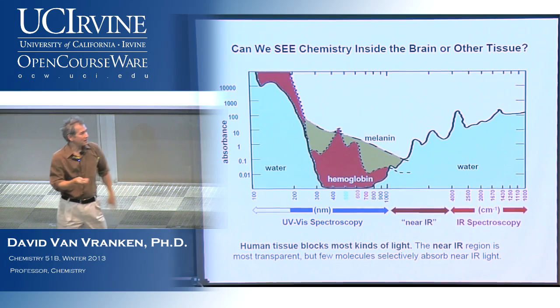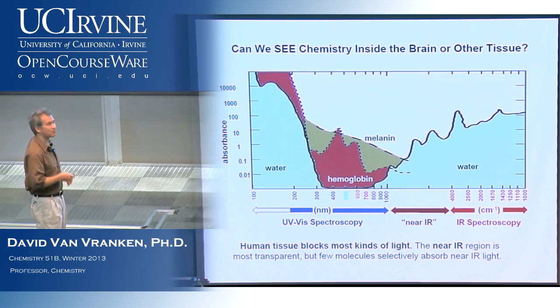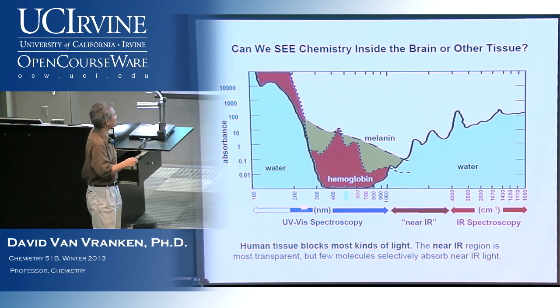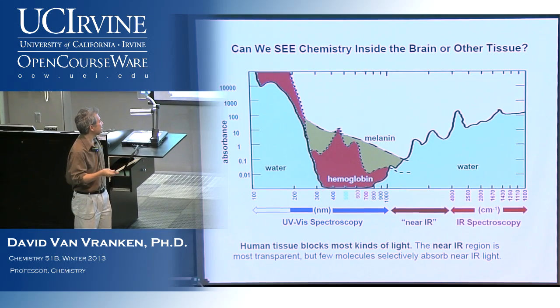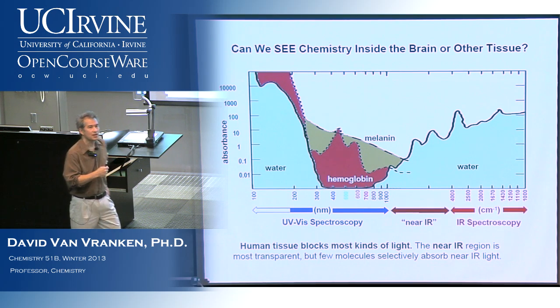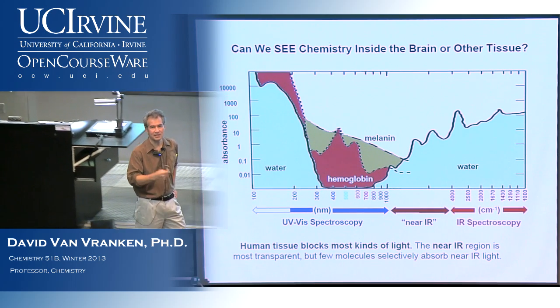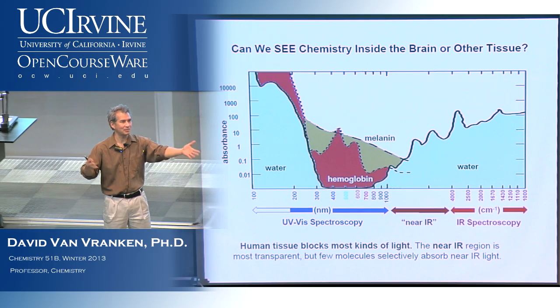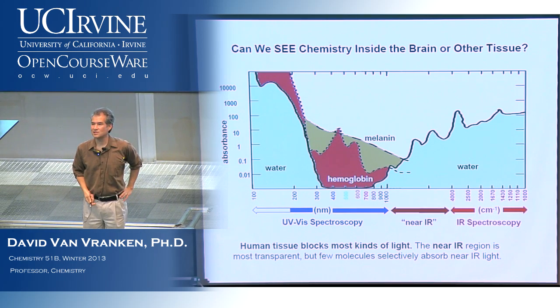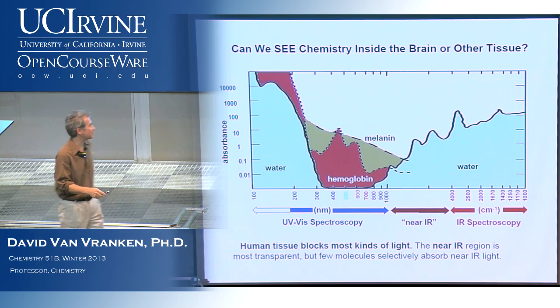And so if you look at the different types of spectroscopy that we've been talking about in this class, also in Chem 1, general chemistry, you spent a great deal of time using UV vis spectroscopy. You did things with Beer's law. Well, Beer's law still applies to IR and other types of spectroscopy. But you put solutions in little cuvettes and you measured how much light was absorbed.